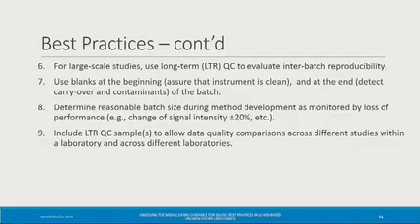Sorry, again, not fully related to this question. Could you clarify what you mean by system suitability test in your queue? Because you had a slide where you had a system suitability sample, and it followed blanks for some reason. What is that exactly? The system suitability sample, in this particular example, I don't remember where that one came from. I don't know what the example was. Do you remember? I'll let Diana. I mean, it might have been your lab. Not your lab. It's not my lab.